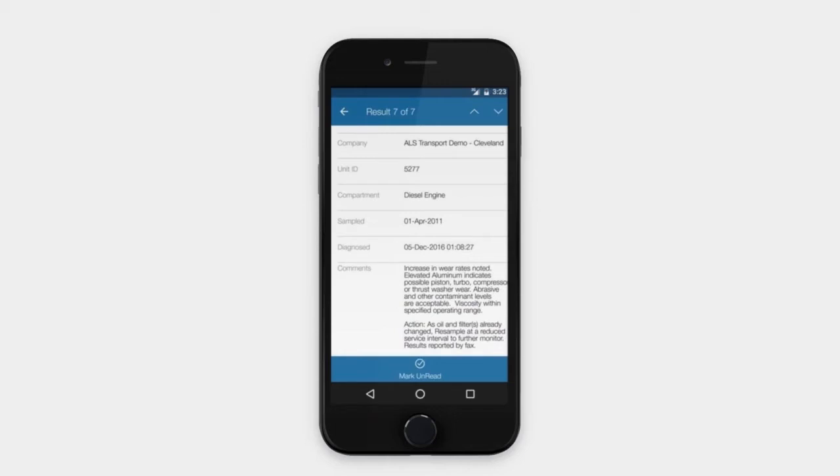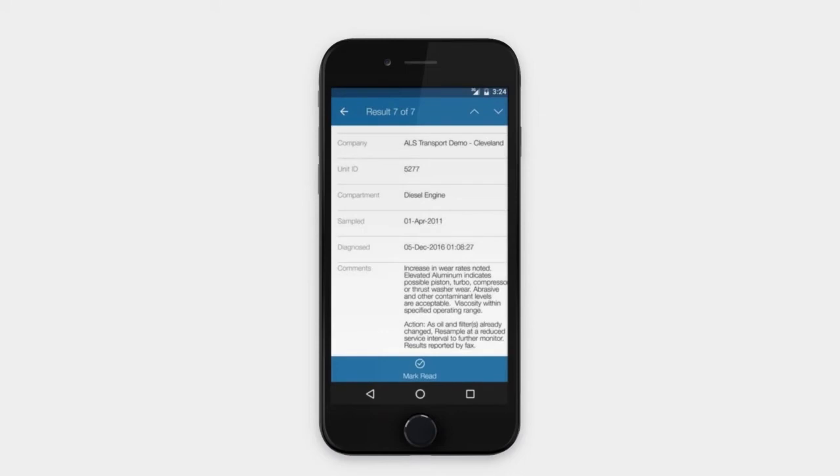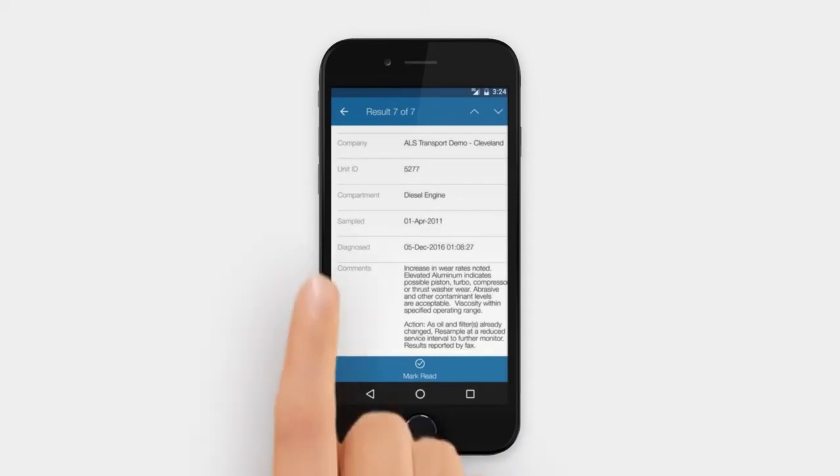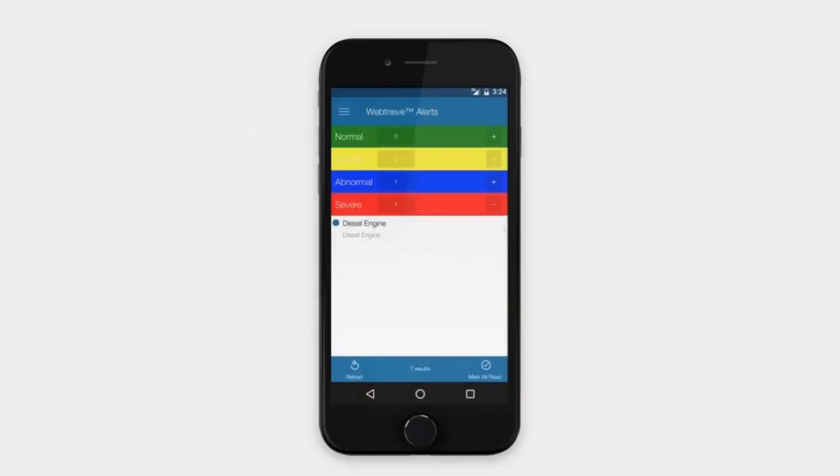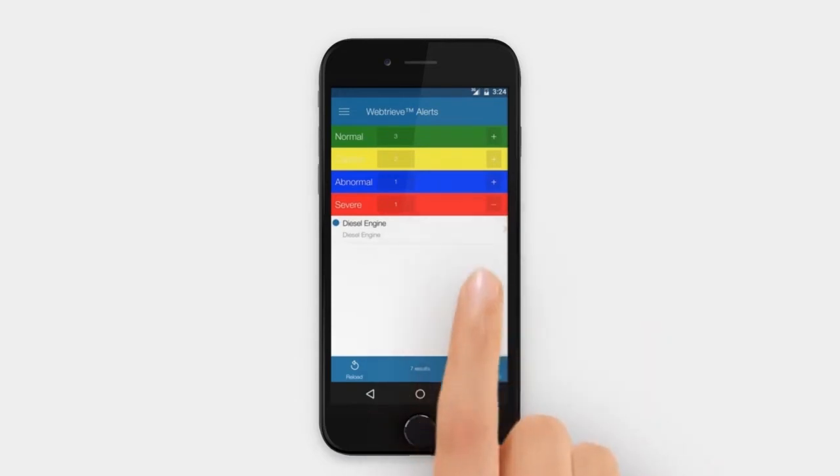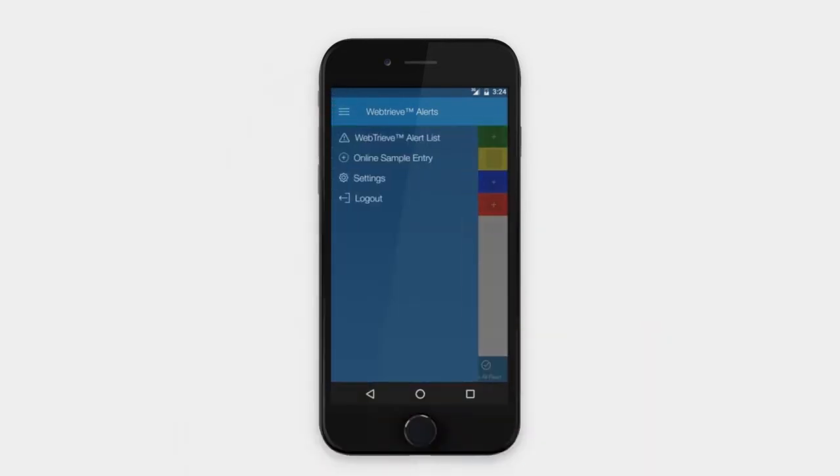Viewing a sample's details automatically marks it as read. The mark as read or mark as unread takes effect when you refresh the list. Until then, you can review samples that are already marked as read. Viewed samples are removed when the list is refreshed.